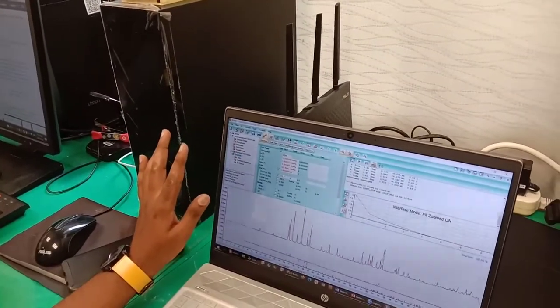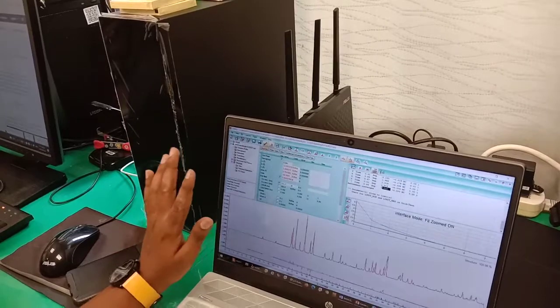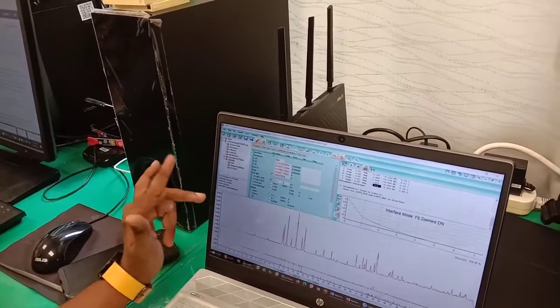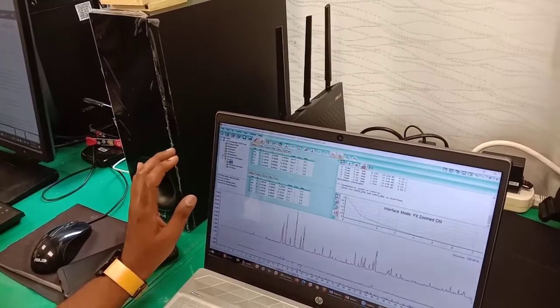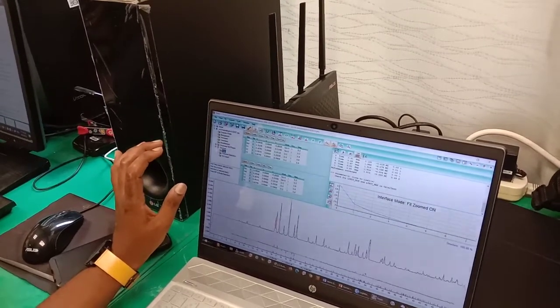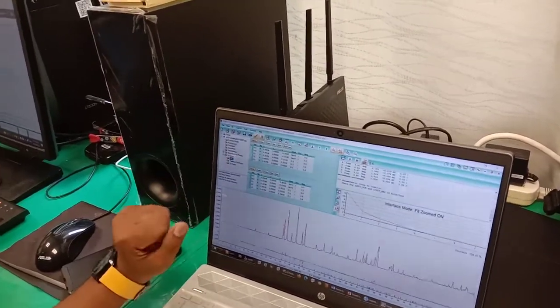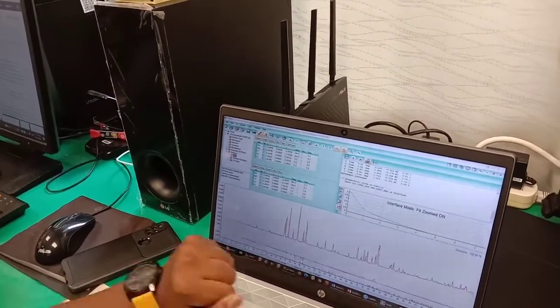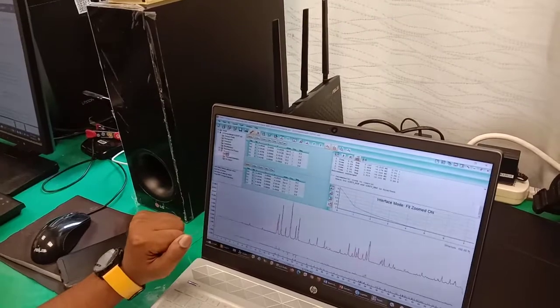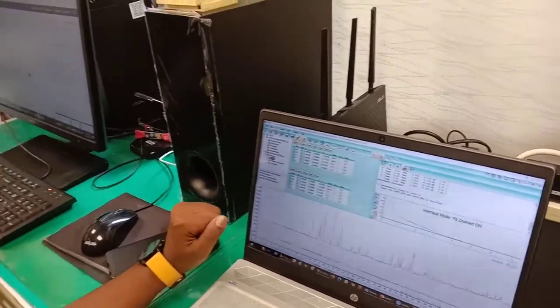Basically you have to get at least a minimum RWP of 10 before going to site refinements. Site refinement means, you can see the gallium is at an XYZ position. When I choose this, the XY position will move a little bit and make the refinement a little bit better, but it won't move much.